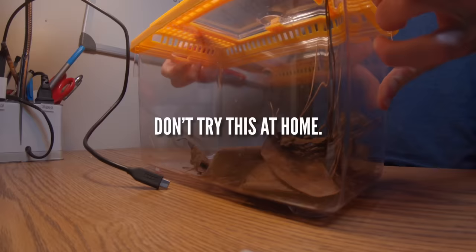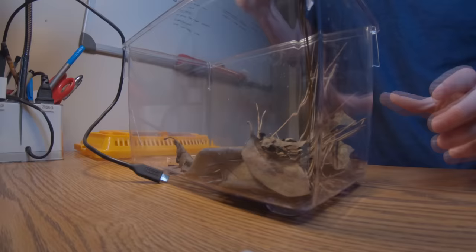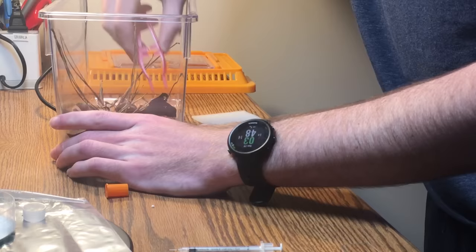Now we've got our spider, it's time to get our blood sample. We've got our blood sample, now to get the venom. This is gonna be challenging. Not super, super confident with forceps, so we'll see if we can get the spider with these.